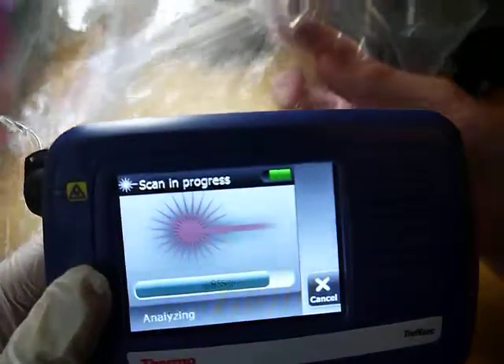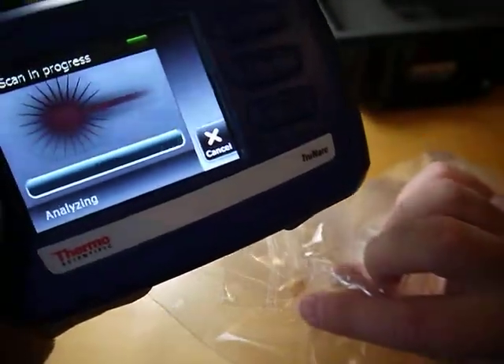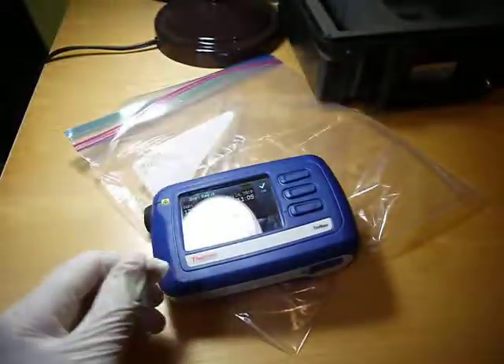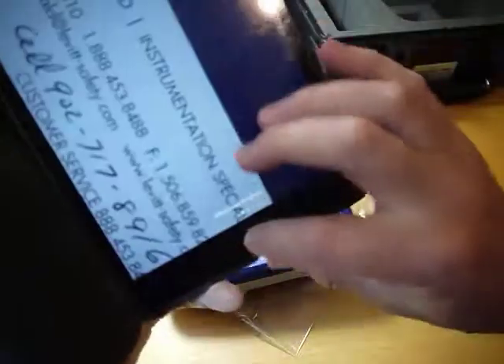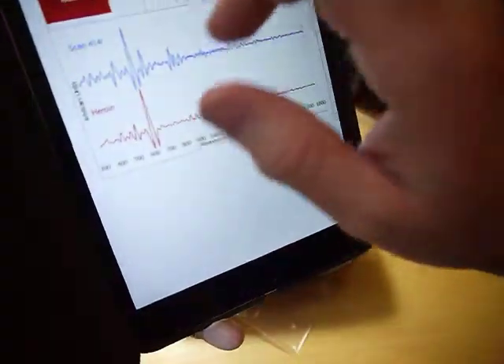Now looking at that, if I didn't have the prescription I wouldn't have a clue what that pill is. So it's identified it — cyclobenzaprine, which again I don't even remember what that was for. It's in this library.